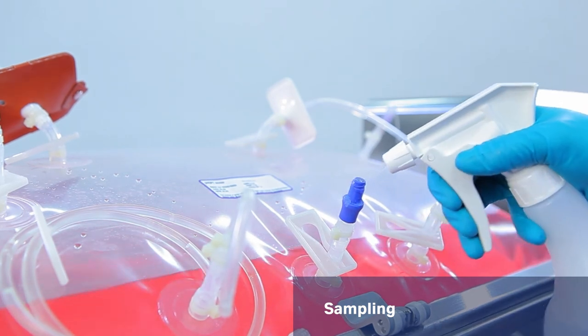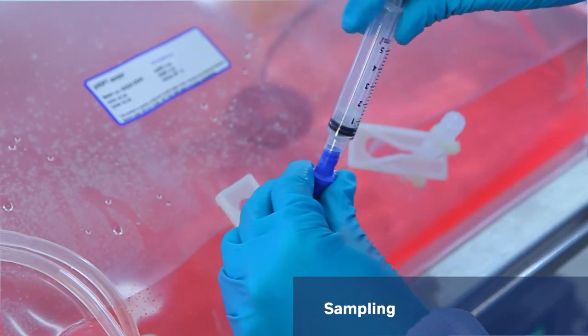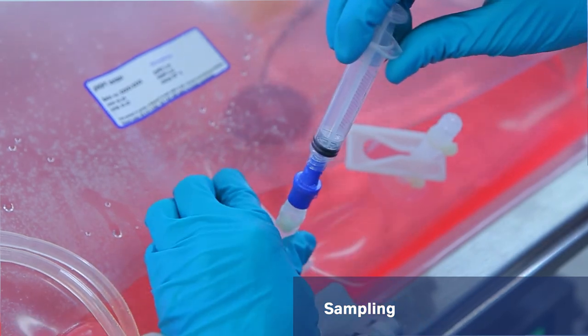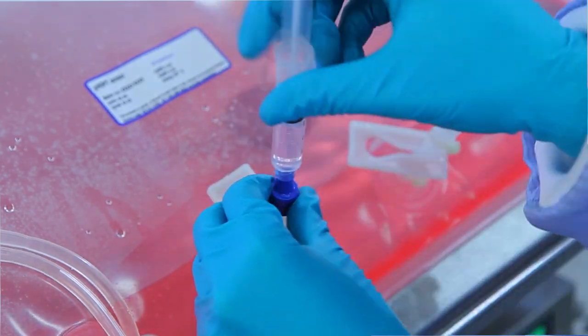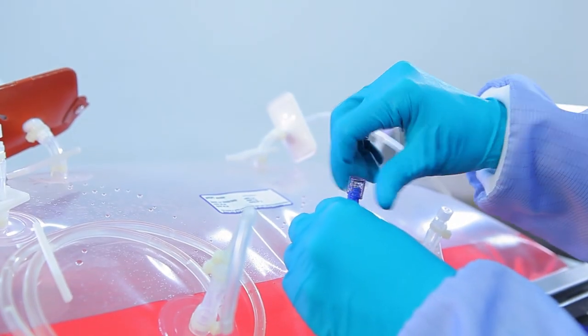When sampling, stop the rocking motion and attach a sterile syringe to the aseptic sampling port using the Luer connector. Take out your sample. Detach the syringe from the port and put the lid back on.